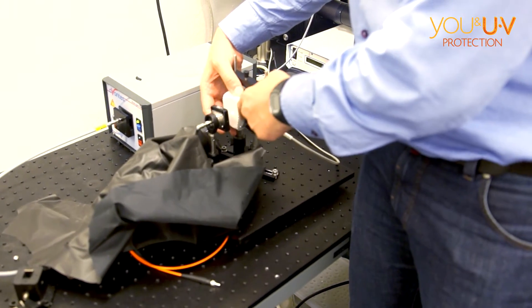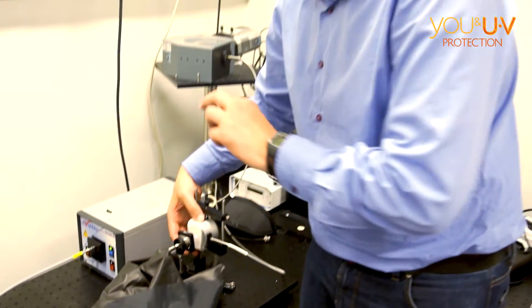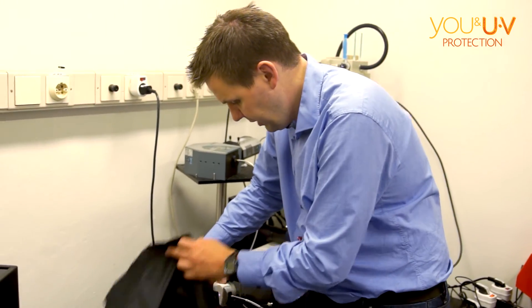We should have a filter behind here to block off fluorescence, but because of the way we're detecting the light, it's not a problem. The fluorescence is in a different part of the spectrum—the fluorescence we get is over here, and we're interested here. It's a problem you can ignore quite easily.